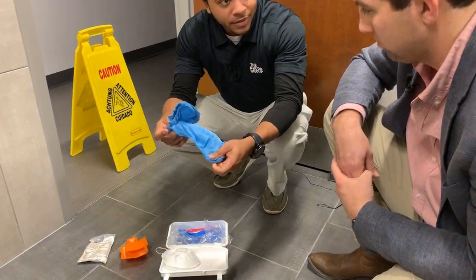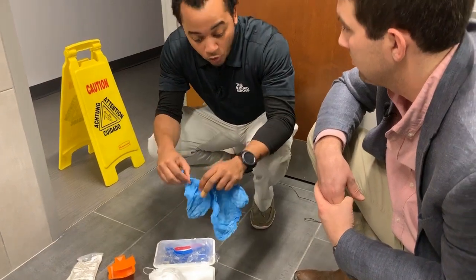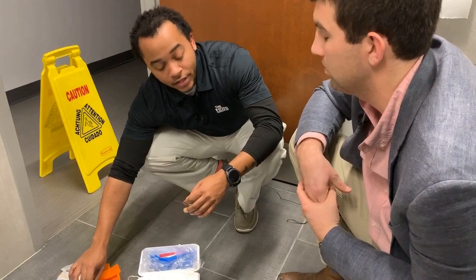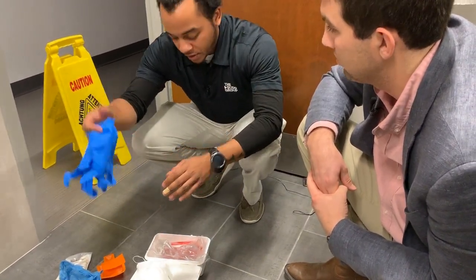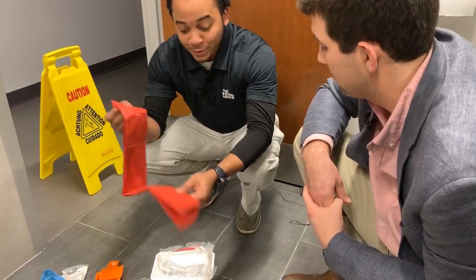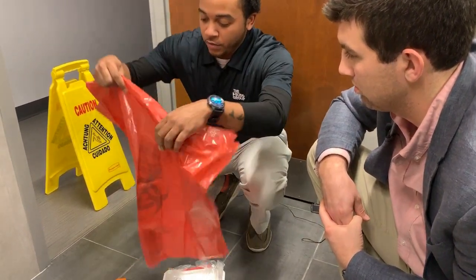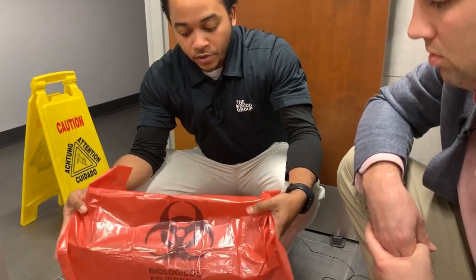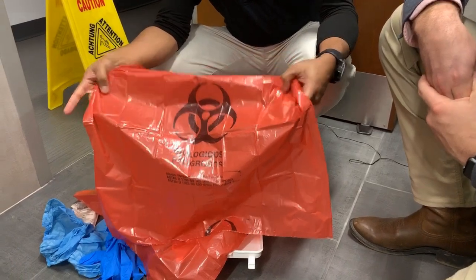Our booties. This goes on the bottom of your shoes, around your shoes. You can actually put them over top of your shoes. I can see that would be really important if the spill were on the floor. Exactly. Okay. Then we have a pair of gloves. And look at this. We got a biohazard bag. That same symbol you've seen on the outside of the box is right here on this bag as well. Okay. So everything when we get done goes in here. Correct. Good deal.